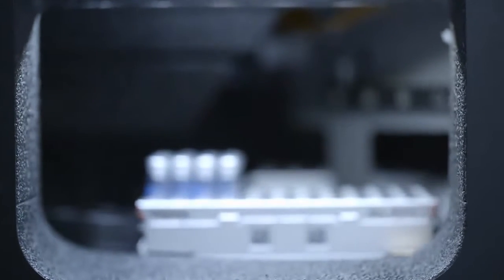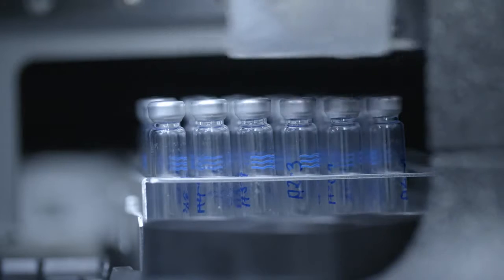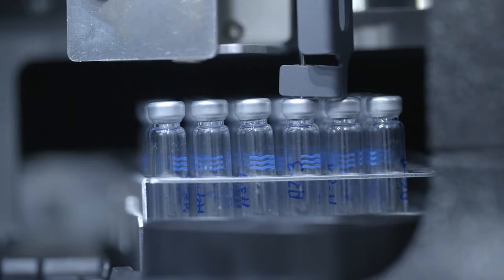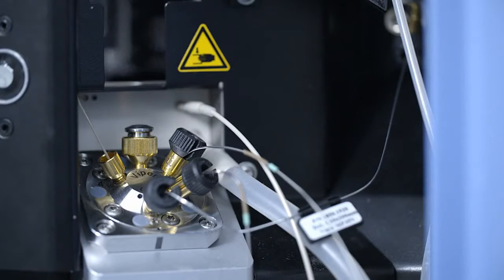My favorite feature is the sample pre-compression because I realized that the sample pre-compression is the major contributor on retention time precision. This is very important, especially in QC departments where you just compare retention times. This intelligent sample pre-compression brings the content of the sample loop up to system pressure before switching the injection valve, and this virtually eliminates any mechanical pressure shock and pressure stress on the packed bed of the UHPLC column. Particularly in biopharma environments there are a lot of quite delicate stationary phases which are really sensitive to any kind of excessive mechanical stress.